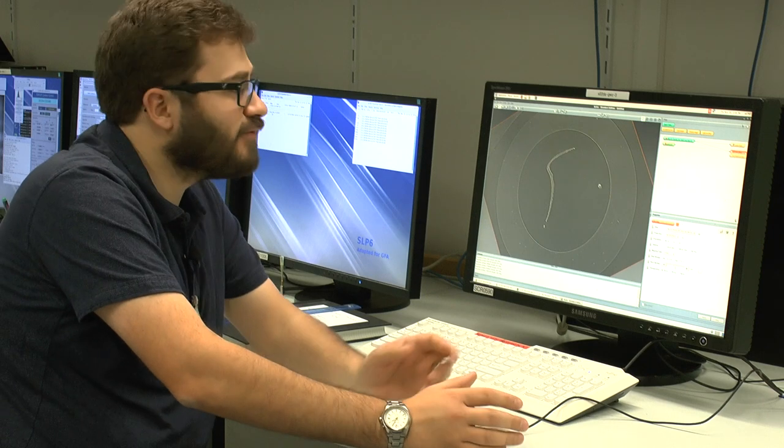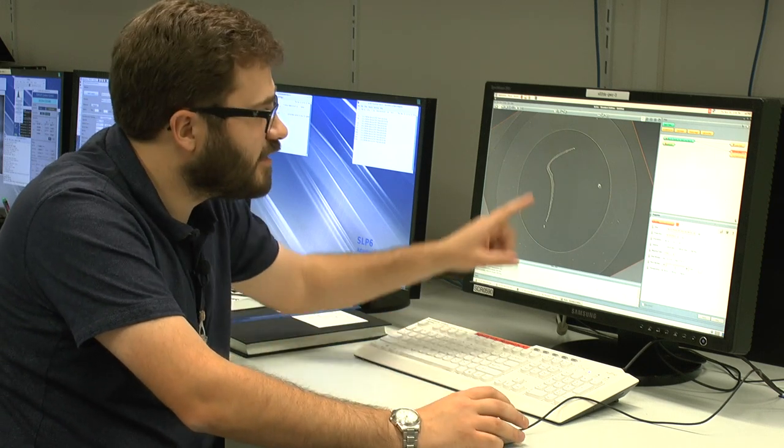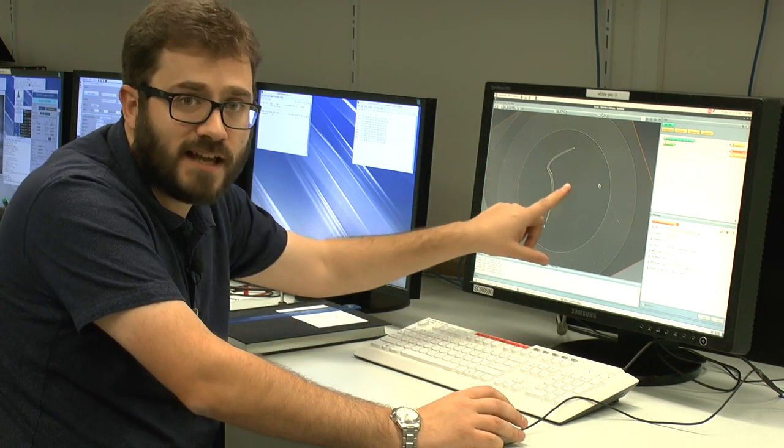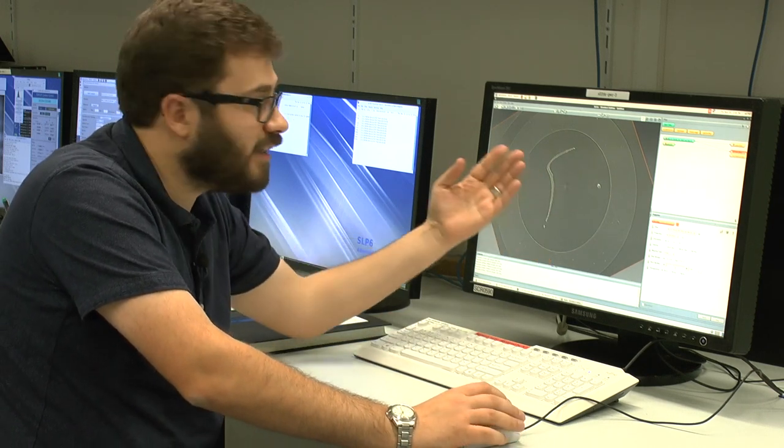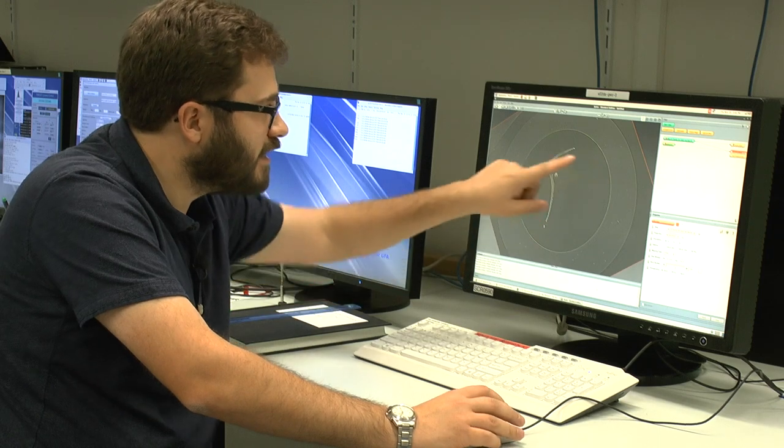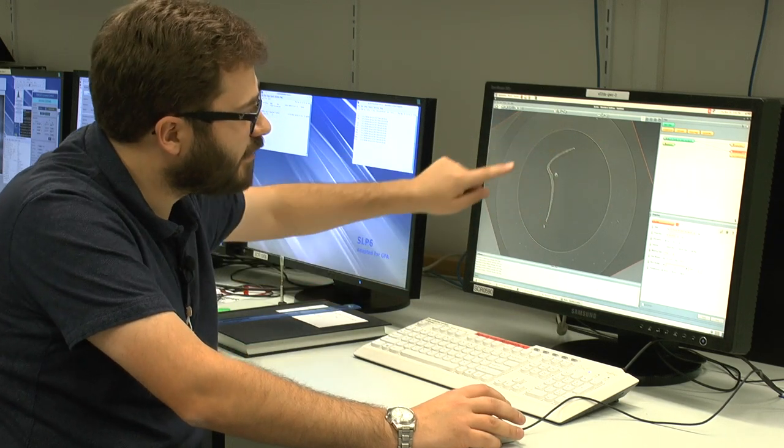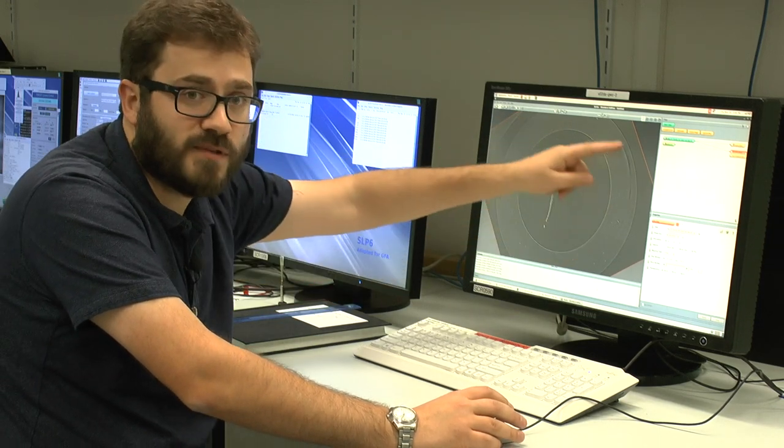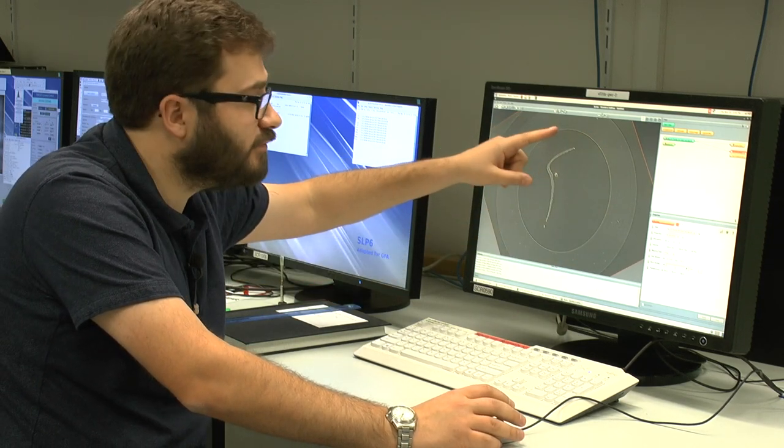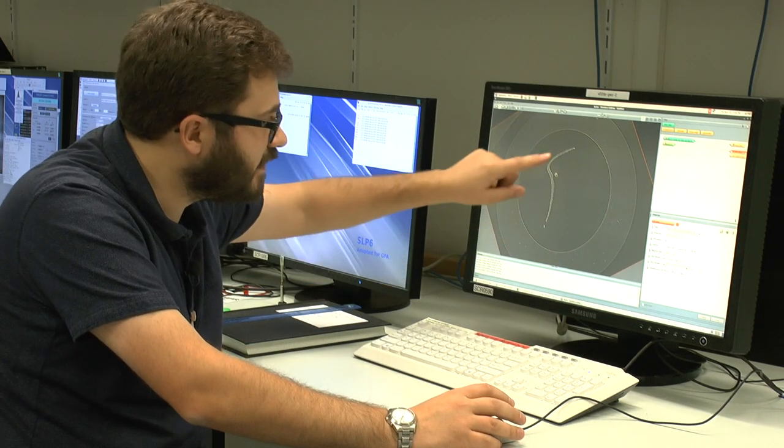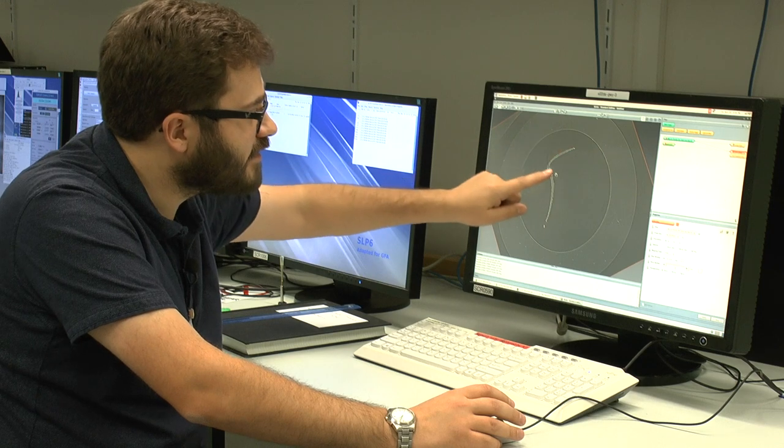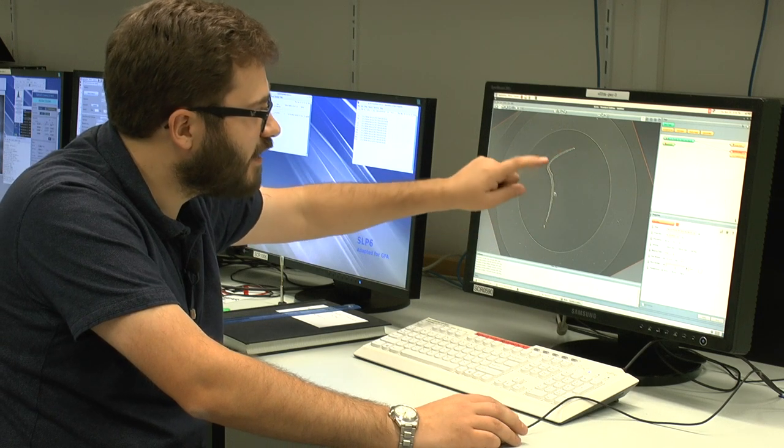So this is the result of the scan. This is a single slice through the lamprey tooth. So this is the plastic tube that we use to mount the specimen, and here is the tooth itself.